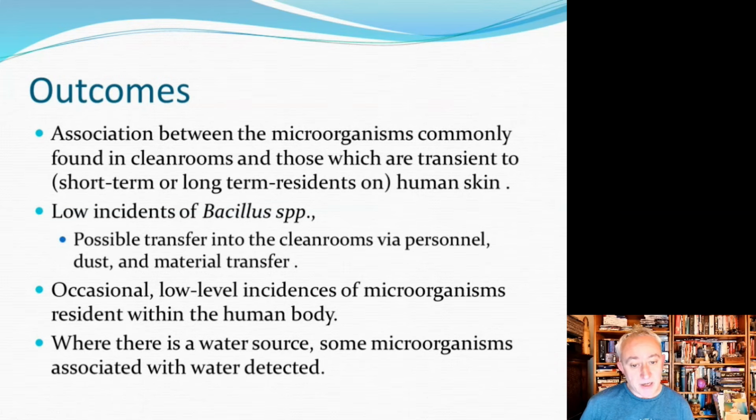We will occasionally, very rarely, get nasty microorganisms that might be resident within the human body, and that's going to come down to gowning, mask control, and people's personal hygiene. And where there is a water source, then we will occasionally get water organisms recovered.